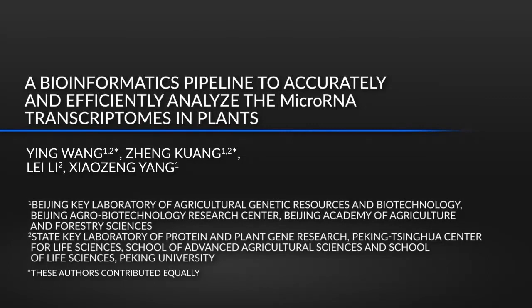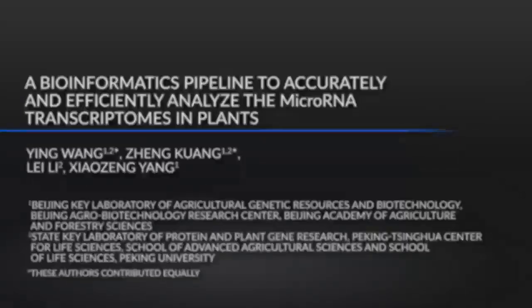miRDP2 can be used to accurately identify plant microRNAs that are important transcriptional regulators in plant development and are crucial for responding to environmental challenges. miRDP2 requires a markedly shortened running time and exhibits an excellent performance in both sensitivity and accuracy, especially for predicting microRNA in plants with a large genome.